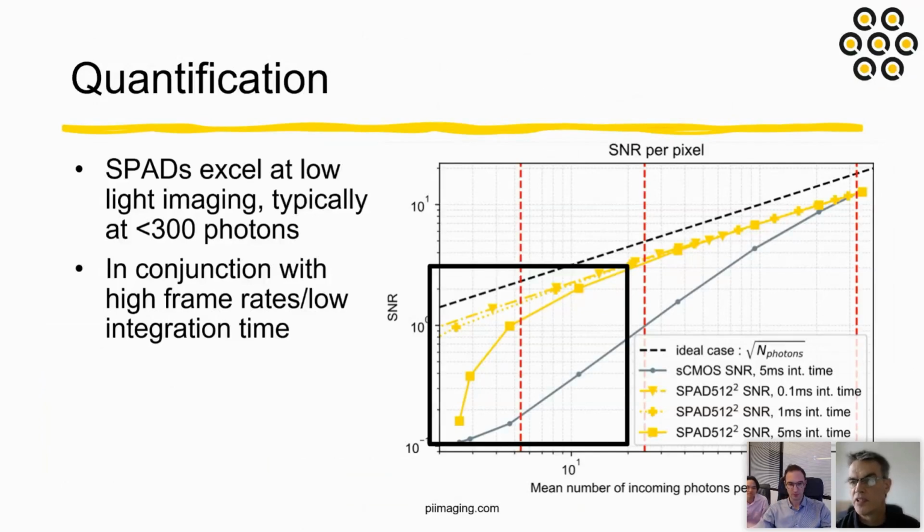And what is the effect of the temperature on QE and the sensitivity of that QE? There is no effect. Okay, that's an easy one. With super resolution imaging, what can you do with SPADs? So why would I want to use a SPAD for super res?